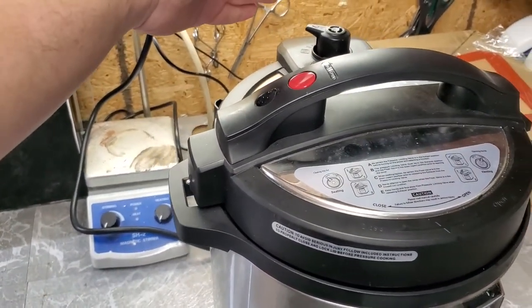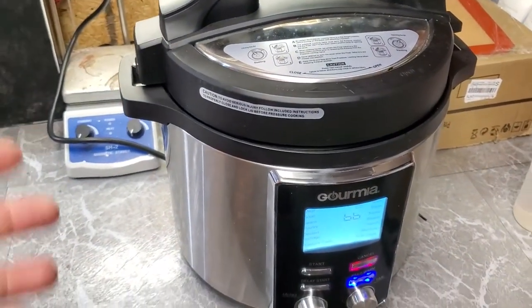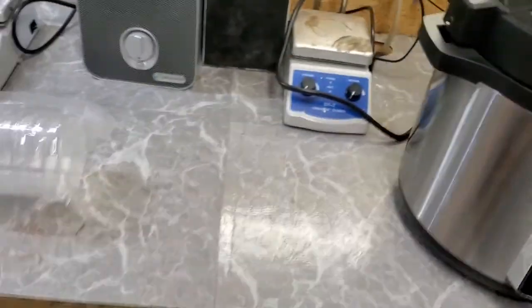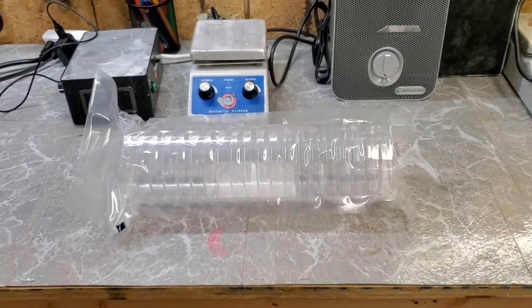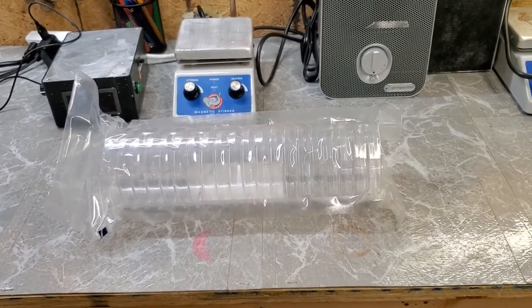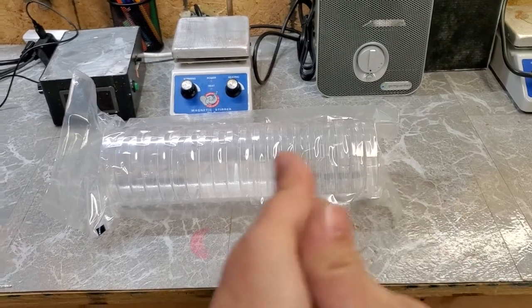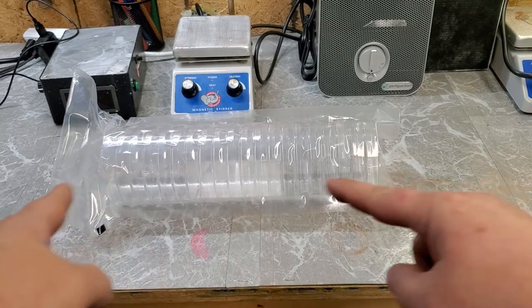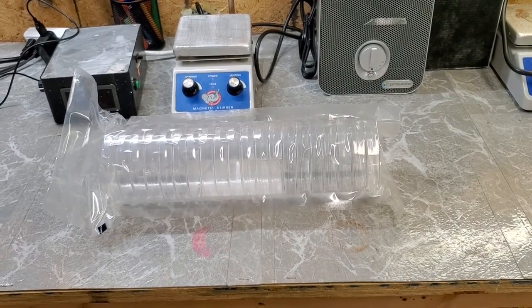So let this cool down for about 10 minutes, then open up this valve to release any remaining pressure. Open it up and pour the agar into these petri dishes. I'm going to set my camera — which is actually my phone — and when the agar is cooled down and ready to go, we'll pour it into the petri dishes.